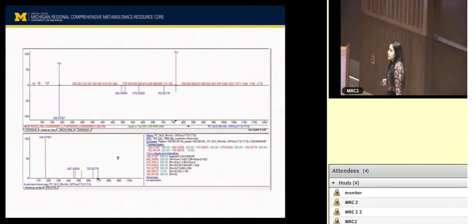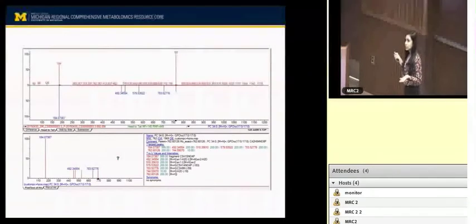What do you mean by different fragmentation? So you're missing some of those fragments, right? Yeah, because this is experimental. Ideally you want to see everything right on top of each other. This is in silico based, so it's based on a pattern. It's artificially generated based on the pattern. This is not a real spectrum from the compound or from the internal standard, but it's based on the pattern of how the classes elute and what the fragment patterns are. Ideally, yes, you would want to see everything, but experimental is not always ideal, right? You want to match the maximum. If you get the major ones, then this is the right hit, but ideally we would not see all of them.